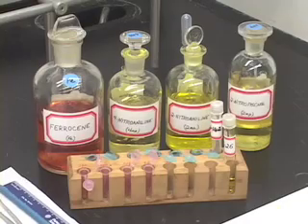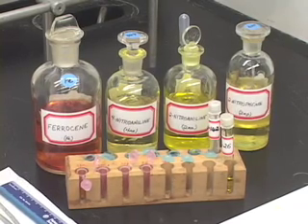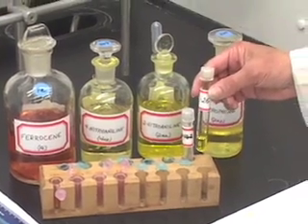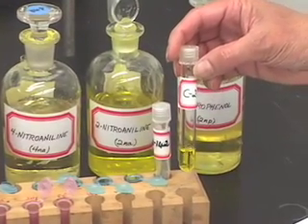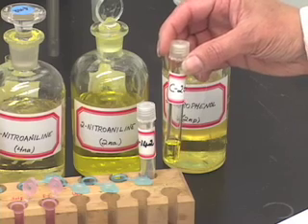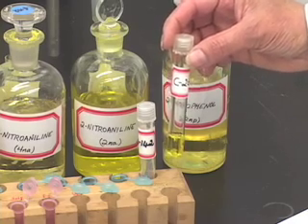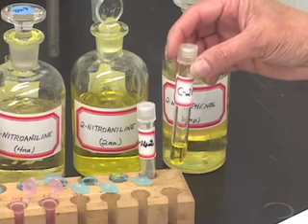Today's experiment is thin layer chromatography. One of the uses of thin layer chromatography is to determine the components of an unknown mixture. In this case, my unknown number is C26. C stands for colored compound. This is my colored unknown that I am going to analyze and determine what components are present in this unknown.